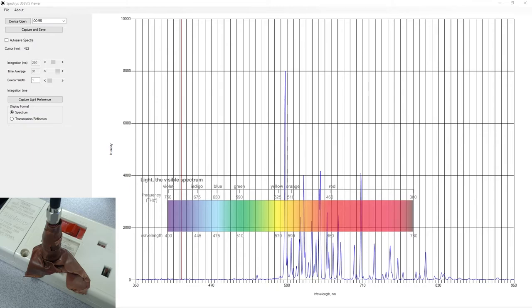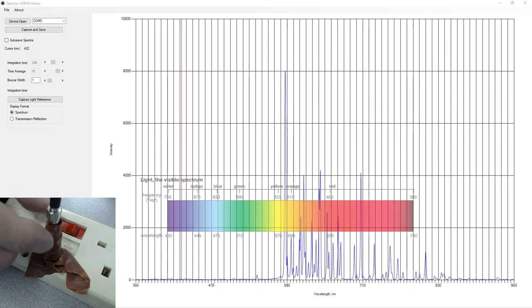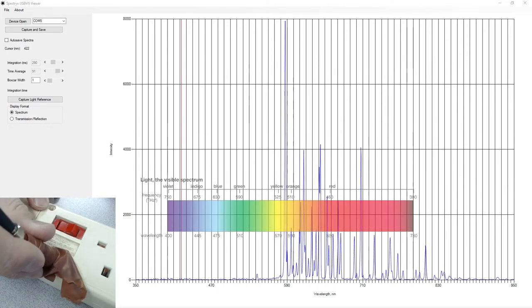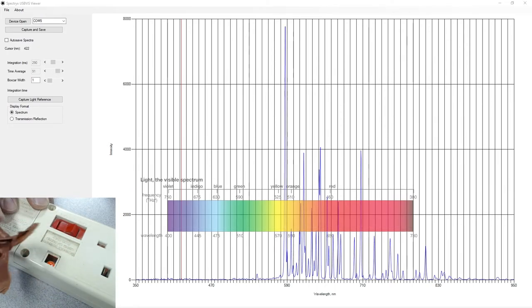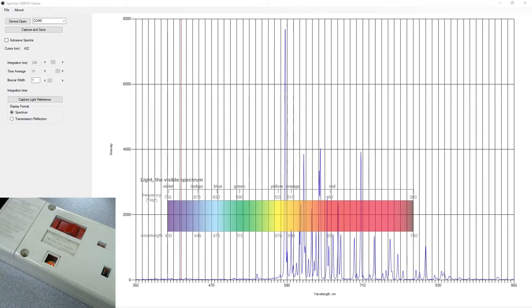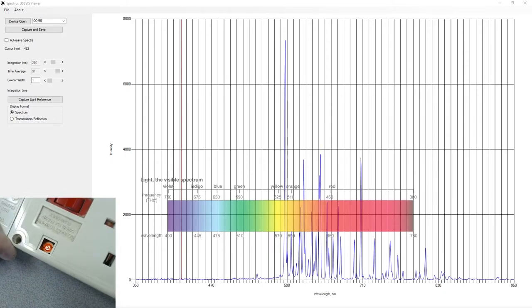We have in our lab here at the moment a number of other old pieces of junk which I will look at for other spectra, and I will show you those shortly. Before I do that, if I take this off you'll see that the spectrum is changing. It is live.